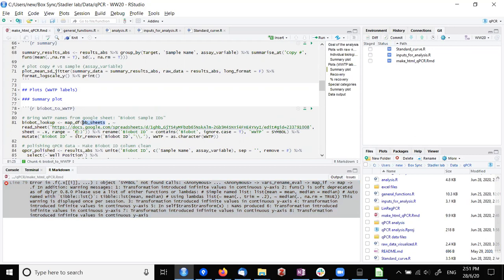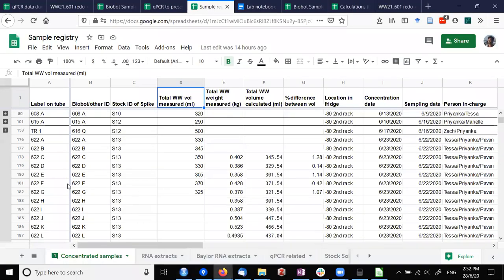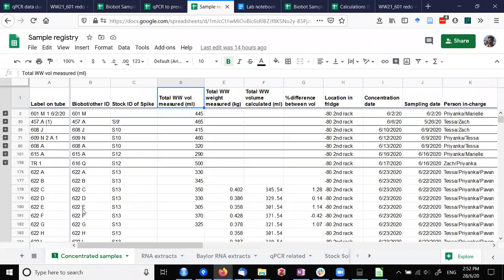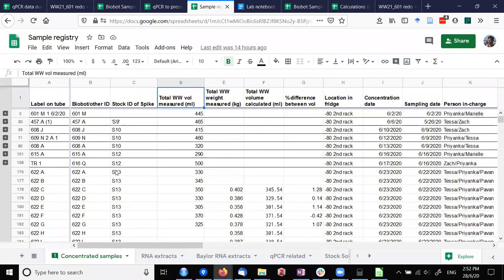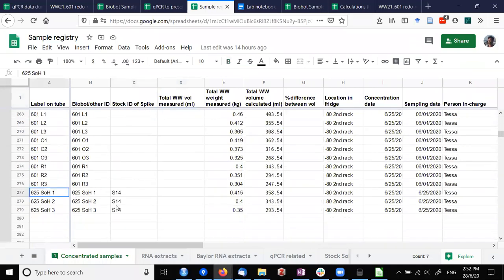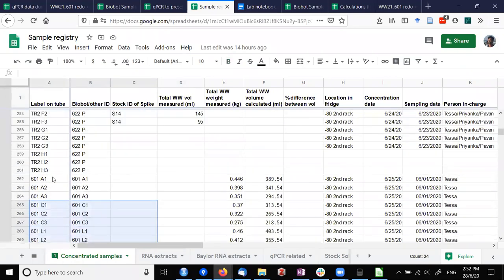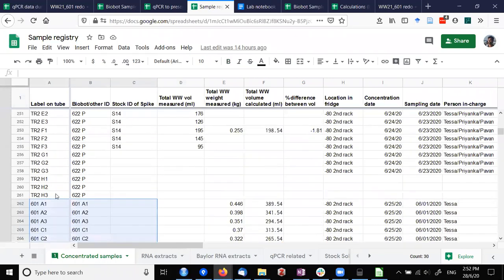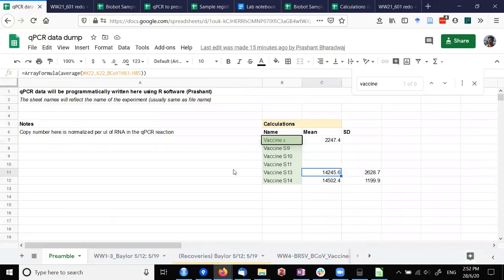Do you remember for the 601s, which vaccine you were comparing for recovery? For the 601s, I think I used the S13 possibly. Okay. Yeah, I go by whatever is written here. They shouldn't have spiked the 601s. But maybe they did. The 601 should have been spiked. So, the 601s were the old spikes, right? Yeah, so I think I took whatever was the oldest spike data we have.